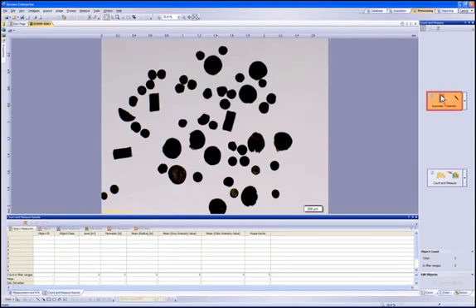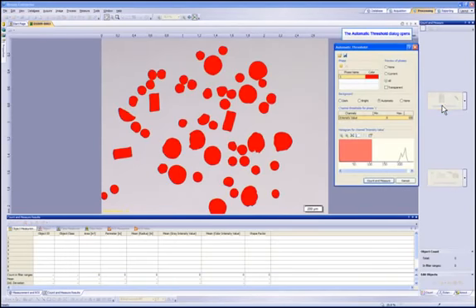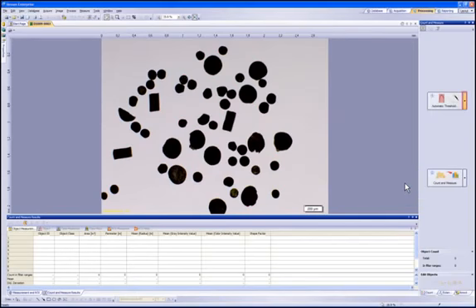Let's select the automatic threshold. The Stream software will determine the best level of threshold needed for the sample image. This automatic detection works very well. If for some reason it fails to capture all points of interest, then you can hit Cancel to change to manual threshold. Clicking on the drop-down will provide other methods of thresholding within the software.